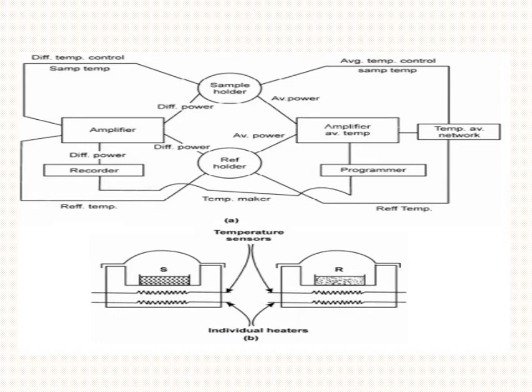So before applying heat and after a certain time, how exactly it reaches the melting point. Till then we will find out the differences by using one amplifier, and when it reaches the melting point, we will observe it through the average amplifier, and it will be monitored.